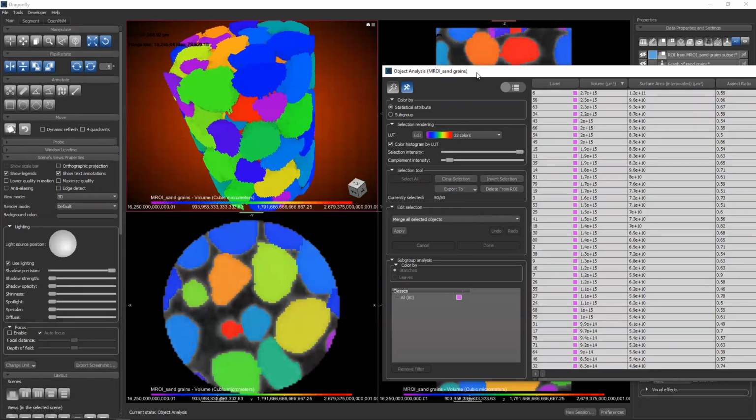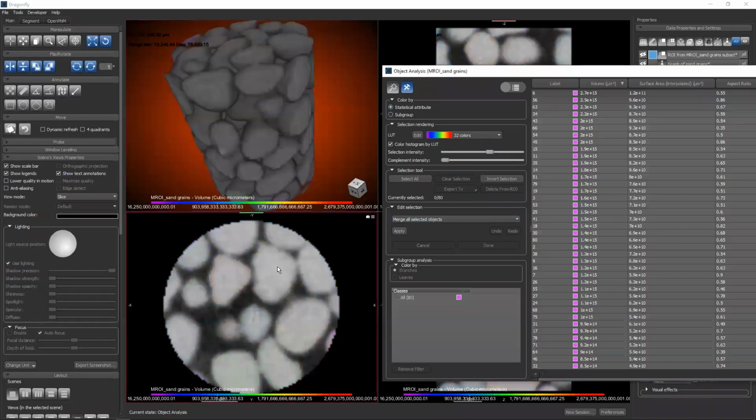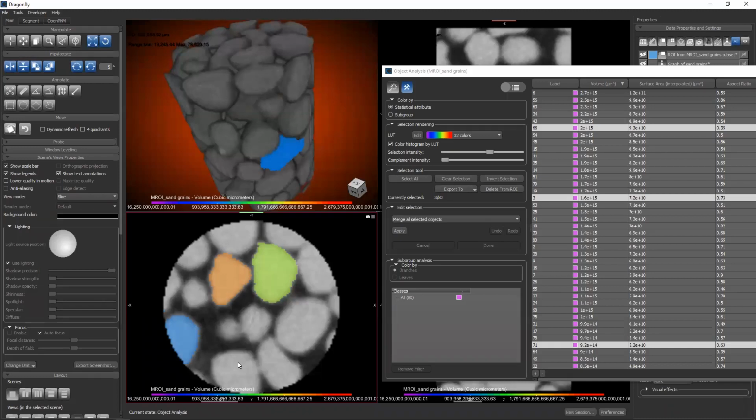Okay. I think that gives a very brief introduction to everything I wanted to show on the multi-ROI behavior. Keep in mind this behavior of showing the highlight and the complement is bound to the currently selected view, which is the 3D view. If I want to do the same analysis in the 2D view, the same coloring, these sliders have one state associated with the 2D views, click here, another state associated with the 3D view. And for those of you that might be asking, let's clear our selection, can you click in the 2D? Yes, you can click in the 2D as well.